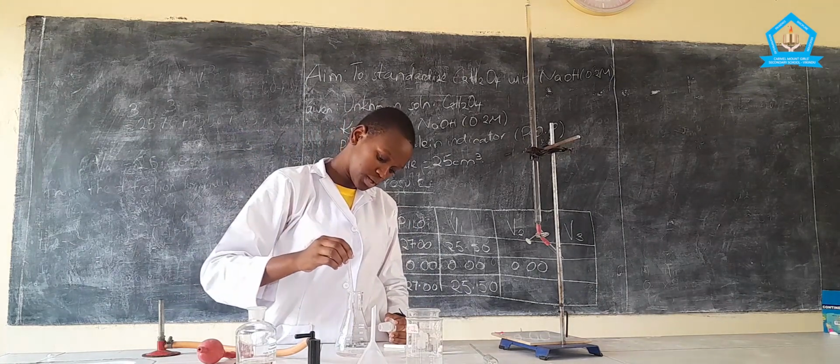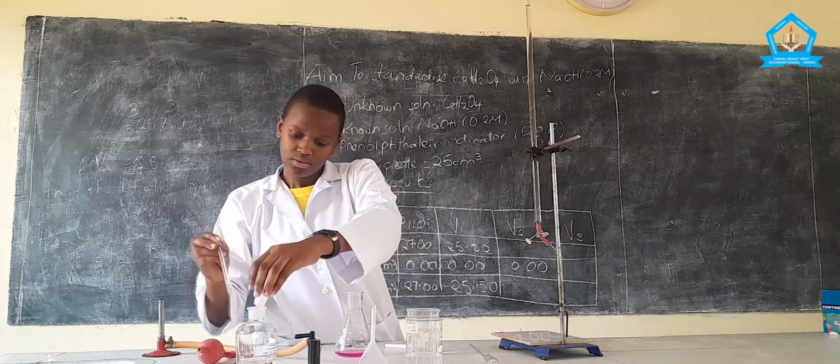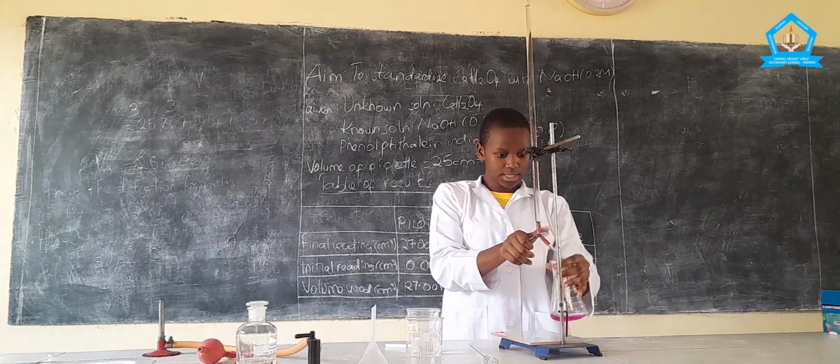Adding 2 drops of indicator. Proceeding with the titration.